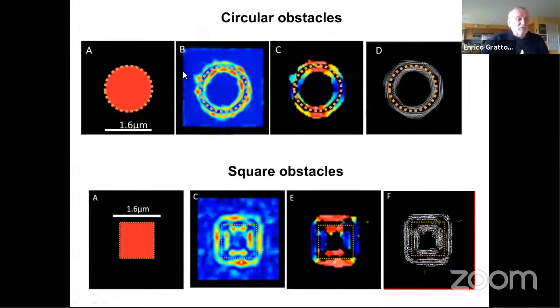So now suppose we have a more complicated shape. So for example, I have a circular barrier. Well, a circular barrier means a particle cannot pass the barrier, so they will give a correlation function which is higher in this direction, higher in the other direction, and now the direction will be horizontal, vertical, depending on where we are. And if I paint that in the form of connectivity map, I will obtain directly where the molecules move. And of course, I can do more complicated things, or that will be a square region.